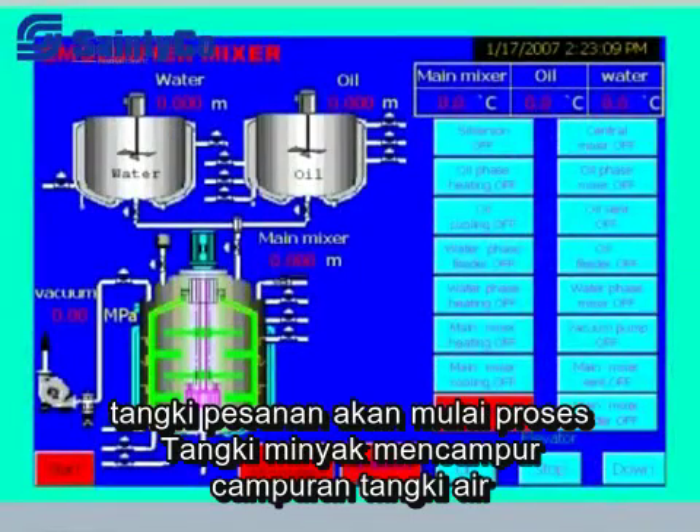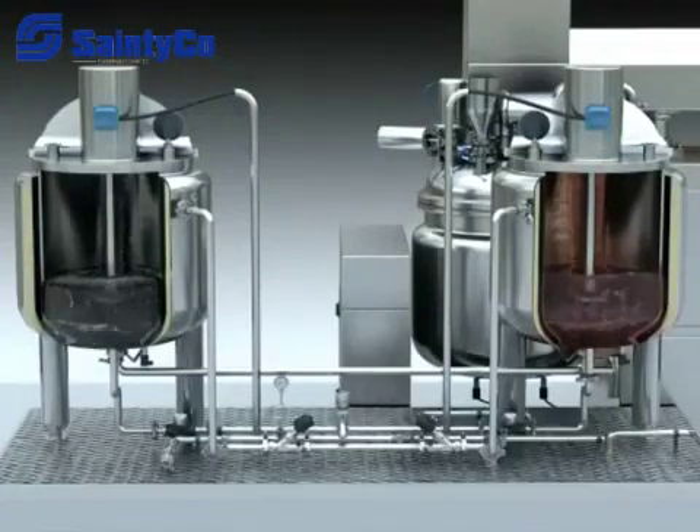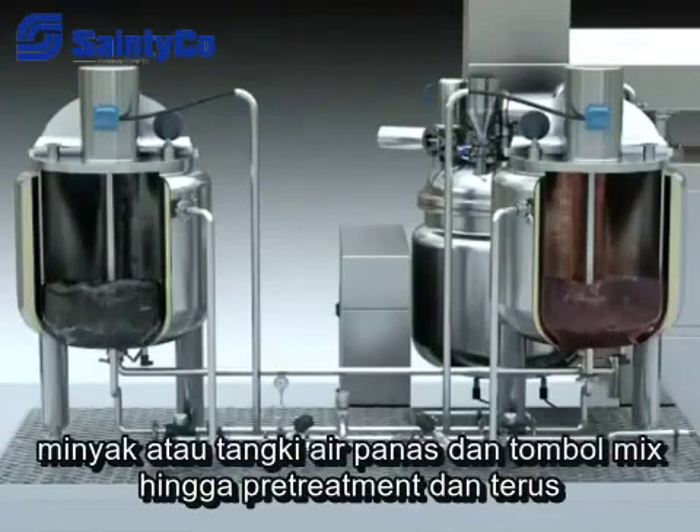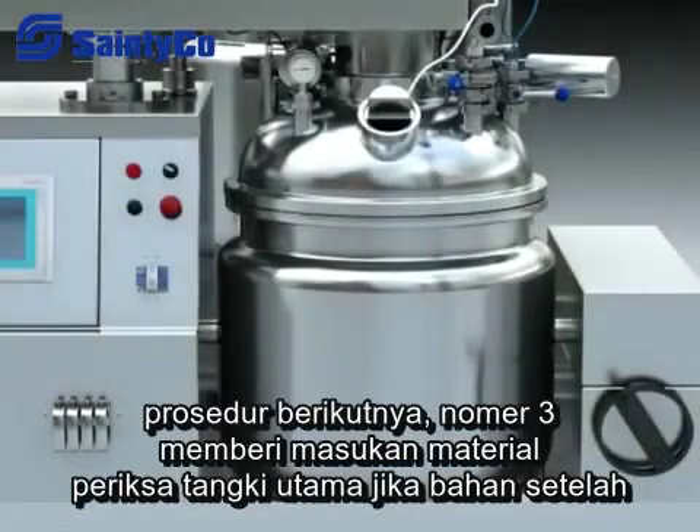Touch the oil tank mix or water tank mix button on the touch screen, and the oil tank or water tank will begin to mix and the material will dissolve. Turn off the oil tank or water tank heat and mix buttons after pre-treatment and continue to the next procedure.